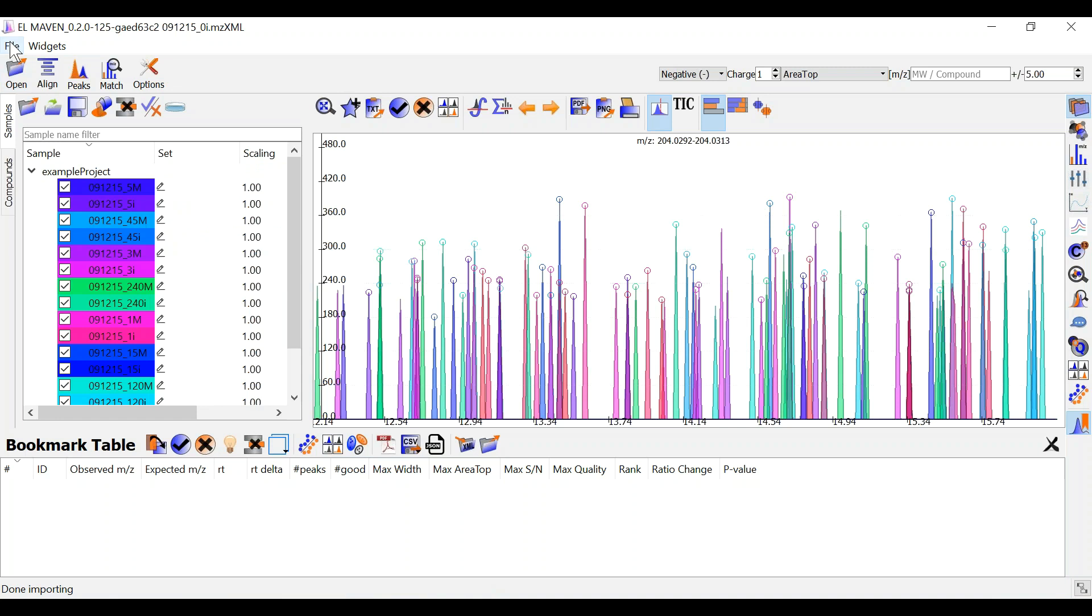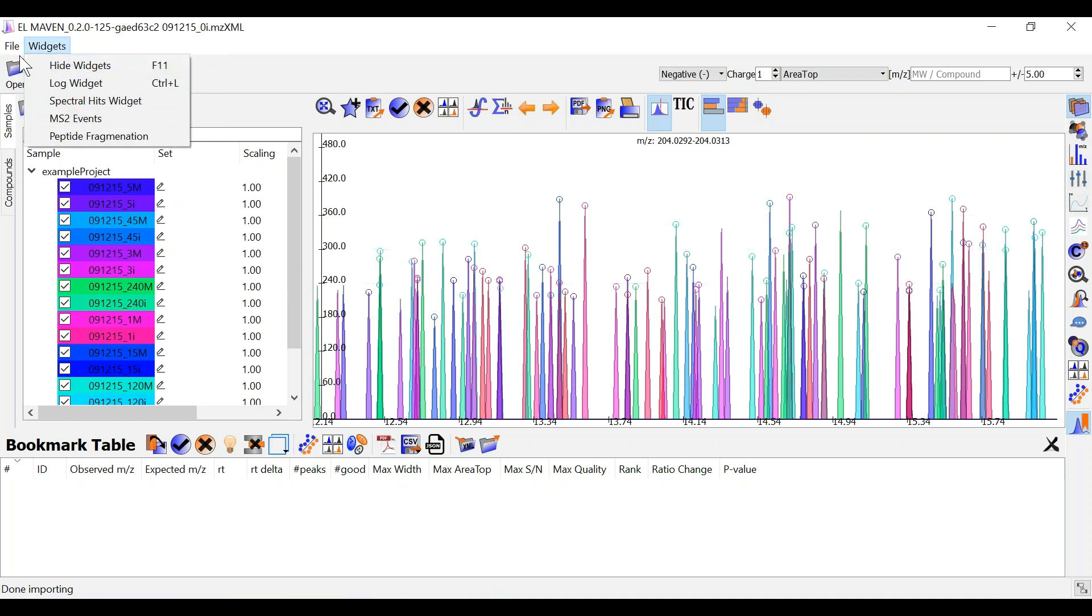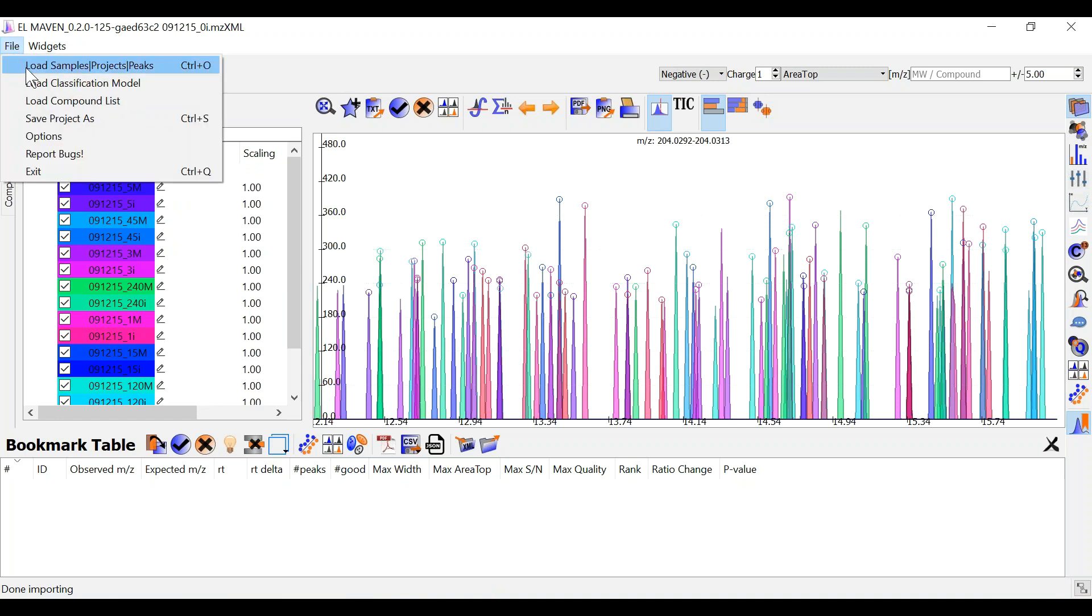You can also load a project by going to file and clicking on load samples projects peaks. This will allow you to upload any mzroll projects that you might have processed earlier.